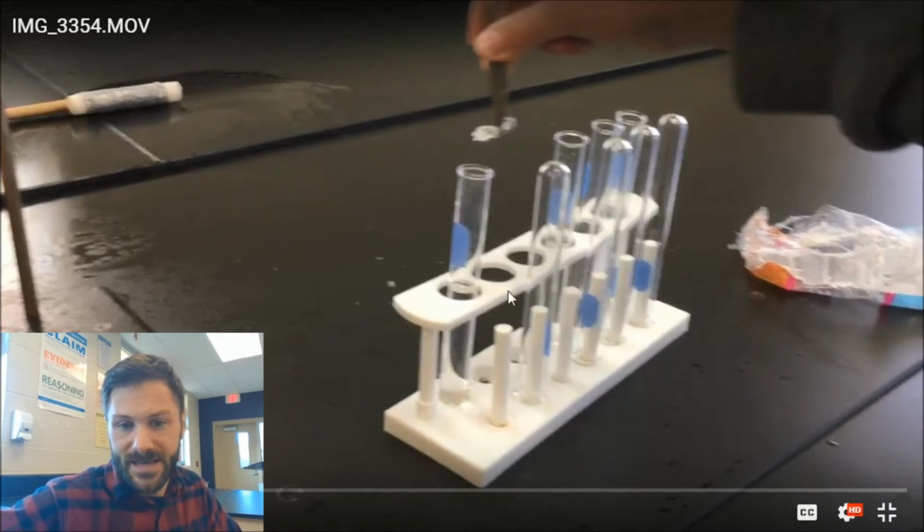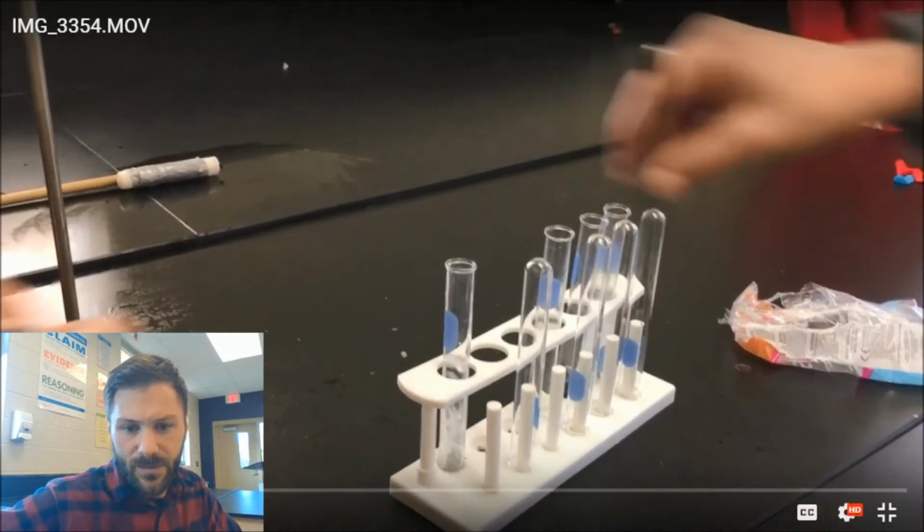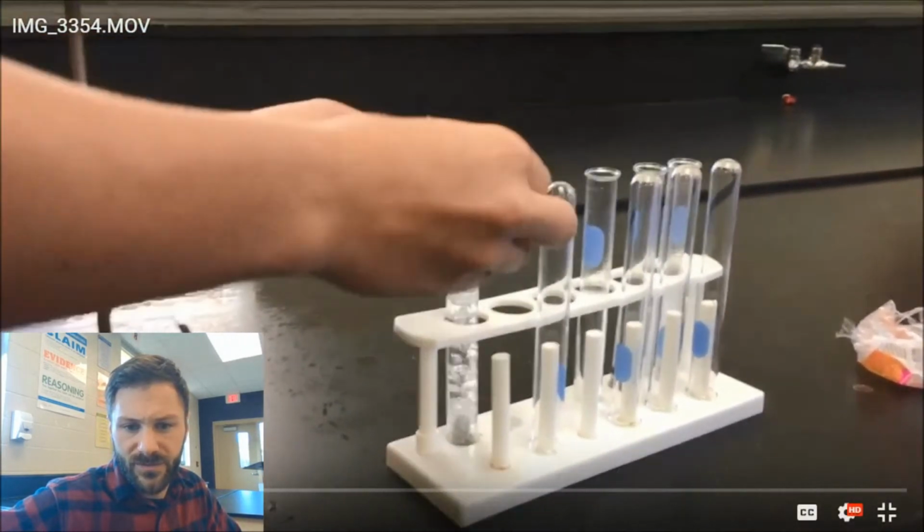He is dropping zinc into a test tube of hydrochloric acid, which, as you can see, when it falls in there, is some pretty potent stuff. We see a lot of bubbling. We see the zinc starting to break apart. But mostly we see a lot of these bubbles.